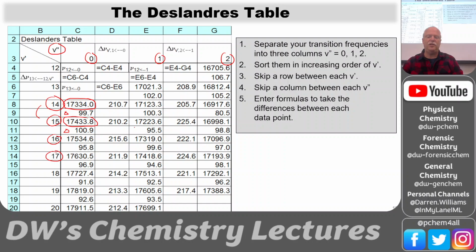The reason this table is useful is, let's say you paste one of your assignments in there and you get 200 instead of 100. You've messed up, you've skipped a line, or something's gone wrong, okay? So this table will help you discover errors. It's a pain to build, but it's a common tool. And so I would say, I want you to learn how to do it.